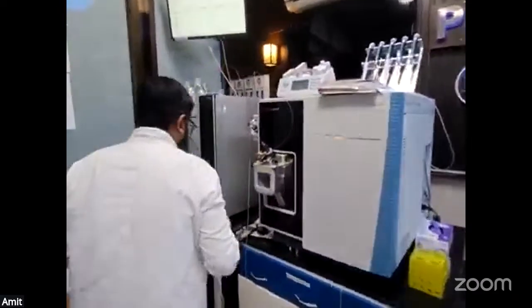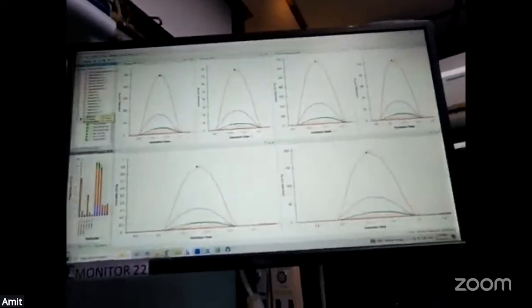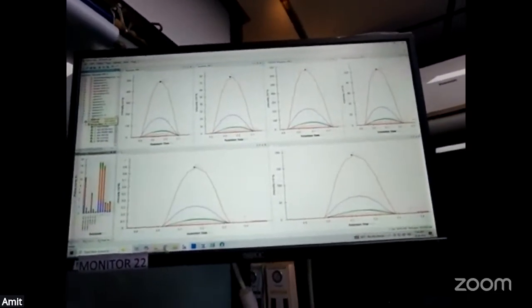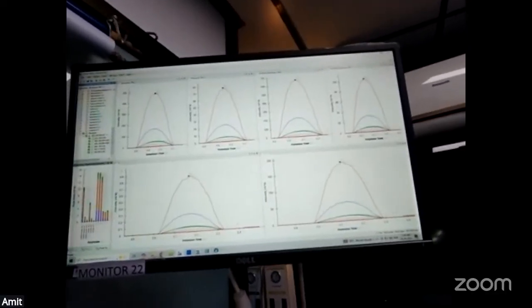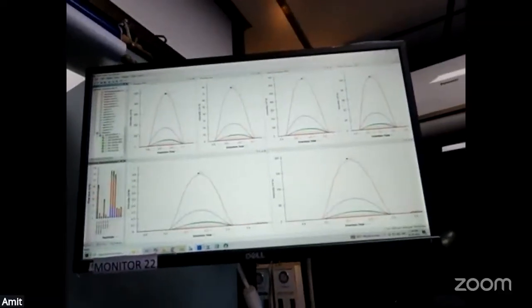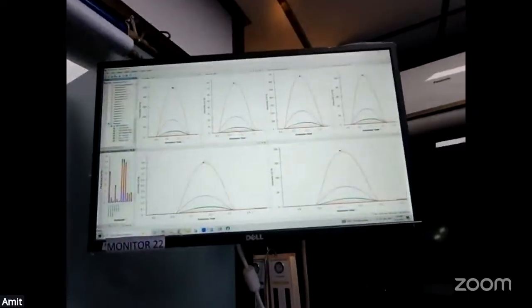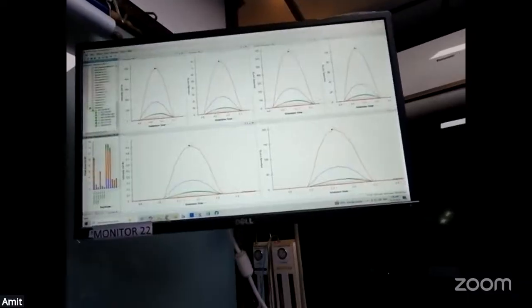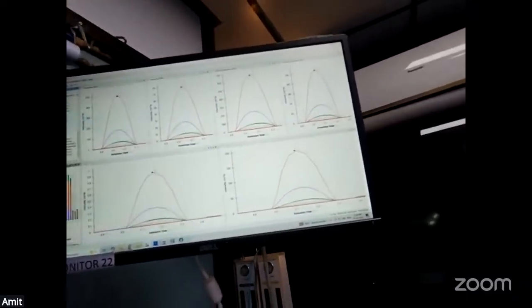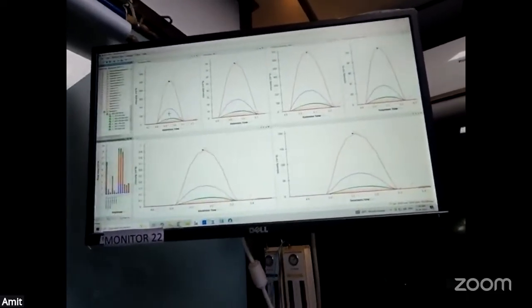So I'll just show you a quick overview of how it is generally done. I can show you for a molecule how we measure. This is done using the Skyline software. So for example, this is one of the compounds. Here you can see the molecular weight, so m/z of the precursor, and these are the products. So we had instructed the instrument to capture each of these precursors and its products specific for this particular molecule to identify, because it is quite a signature to this particular molecule.